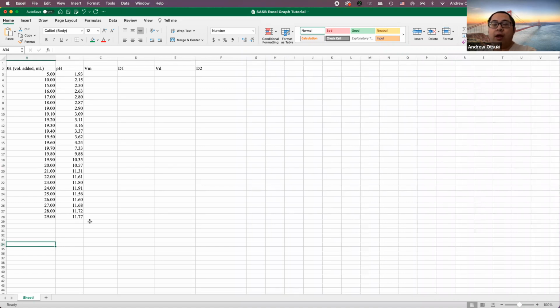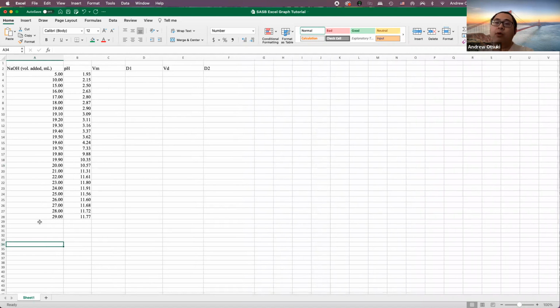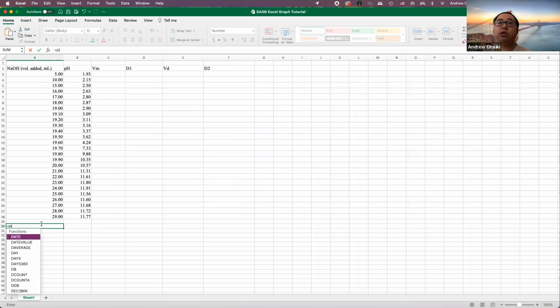Your pH should also be there. So people who actually got through one titration, you'll put your volume that you added by taking the difference of the burette readings, and then the pH, you'll insert the pH you read from the pH meter. So in this column, we want equals difference. So for example, burette reading where you stopped, minus burette reading where you started from. So you're going to record your initial and final values. It might be better to say the volume equals final burette reading minus the initial burette reading. So that's going to be the volume you delivered, okay? All right.